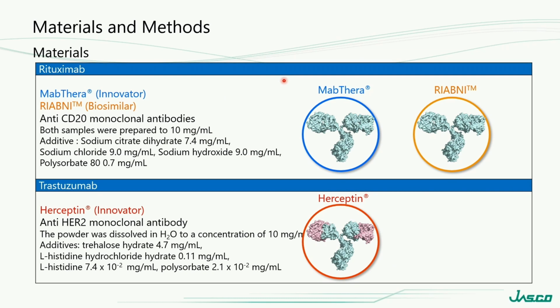In this case, we focused on 3 antibody drugs. Two of them have the same amino acid sequence and formulation condition.